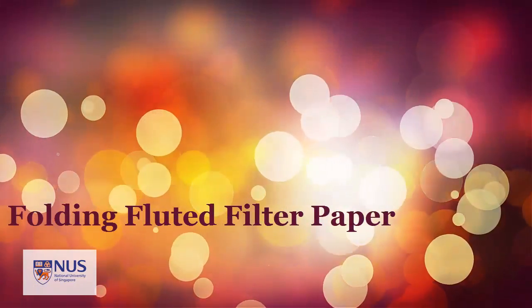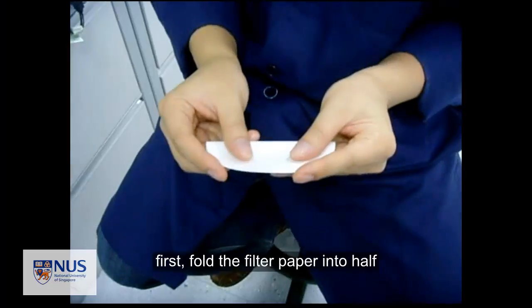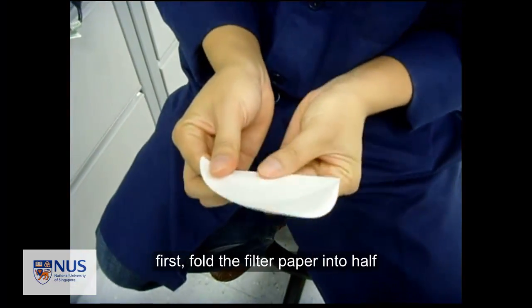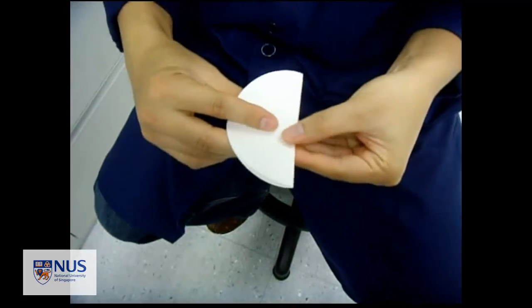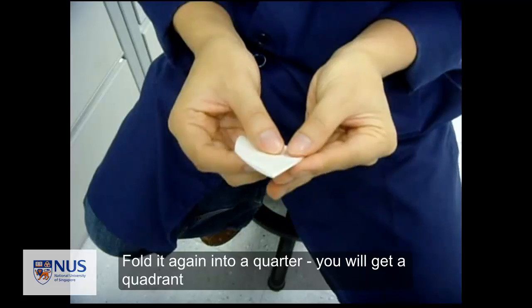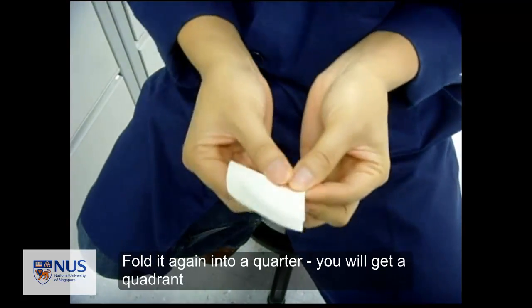In this video, we are going to learn how to fold a fluted filter paper. First, fold the filter paper into halves, and then fold it again to make it into a quarter — like a quadrant.